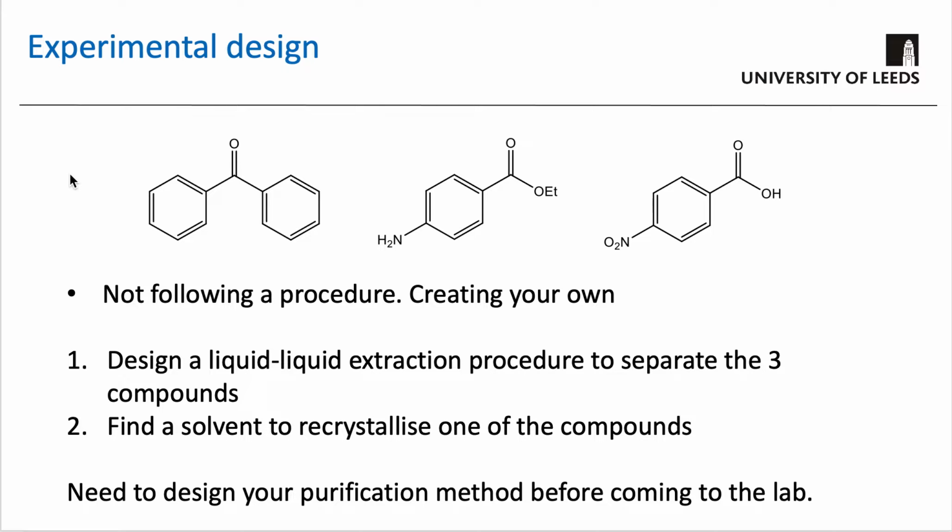Okay, so this video is going to cover some of the really important theory that's going to help you do the experimental design experiments, to help you design a workup procedure that allows you to separate and purify these three compounds using a liquid-liquid extraction.